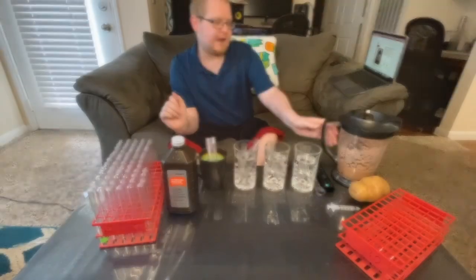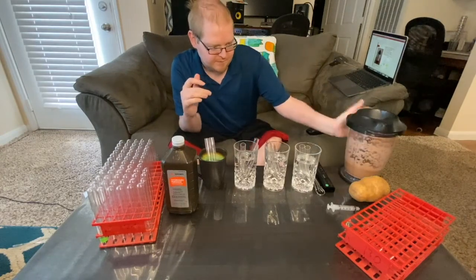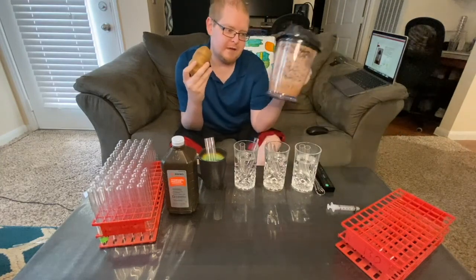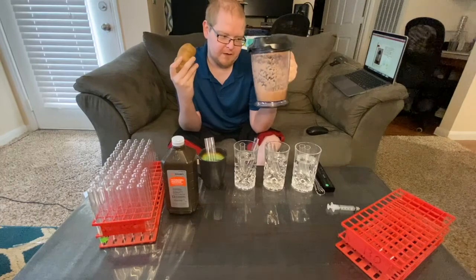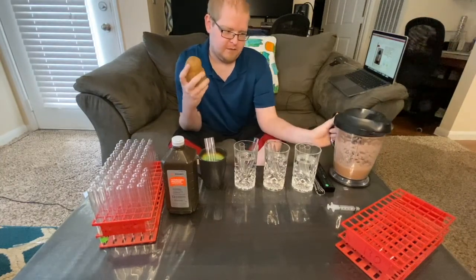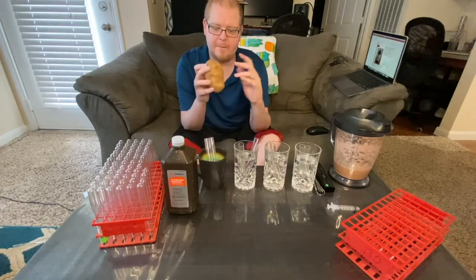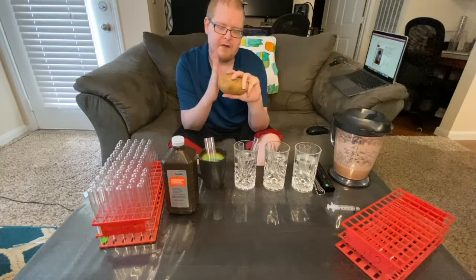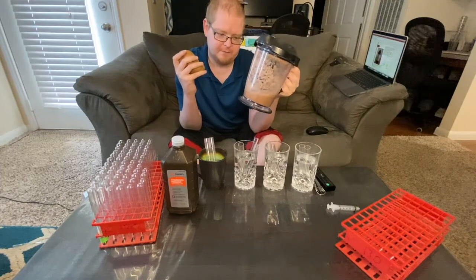All right, so catalase is going to be in our potato. This is a blended potato. I added maybe a cup of water, and what I did was I peeled a potato, cut it, and blended it up in a blender.